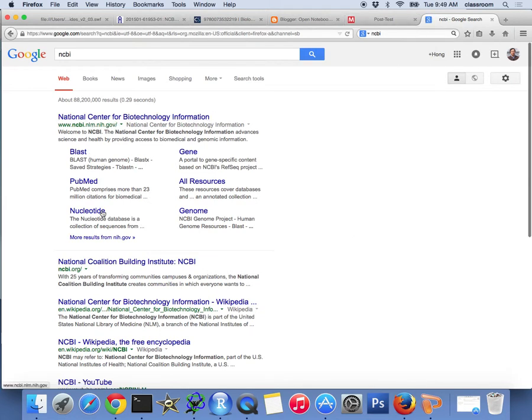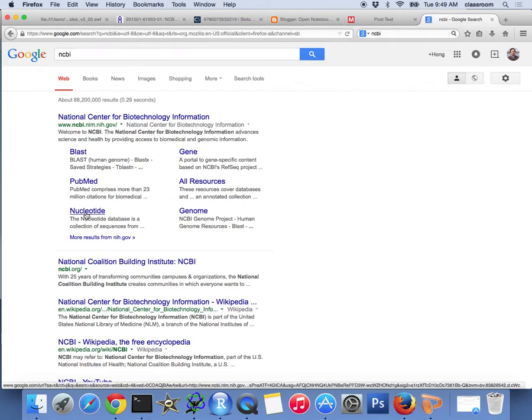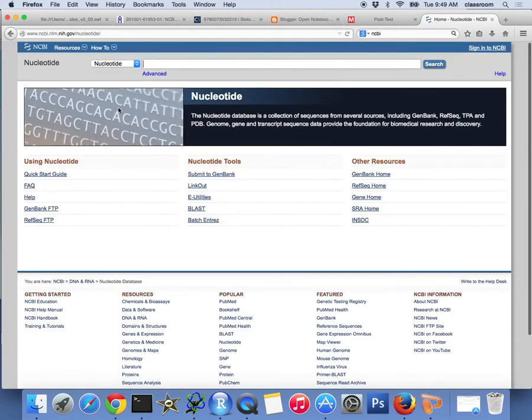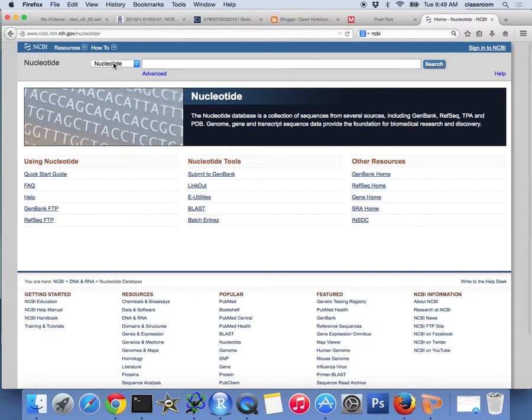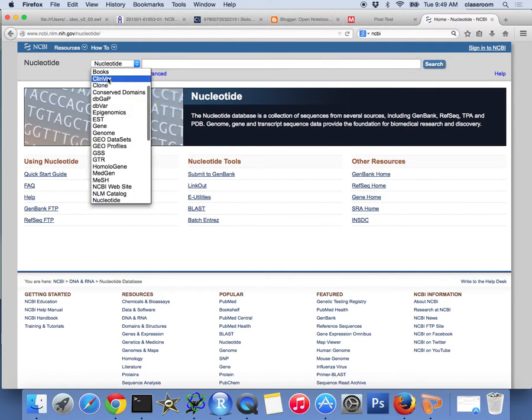That's the NCBI. So once I google it, it actually shows nucleotide. That's a nucleotide database. And if it doesn't go there directly, you can select here.